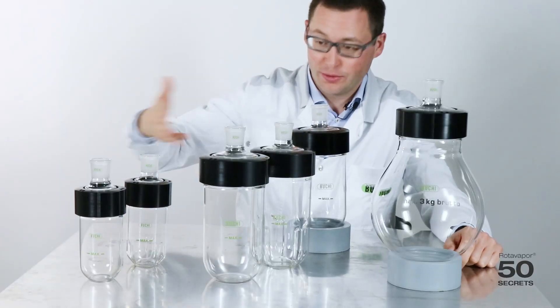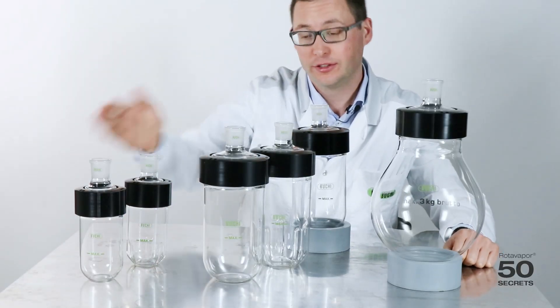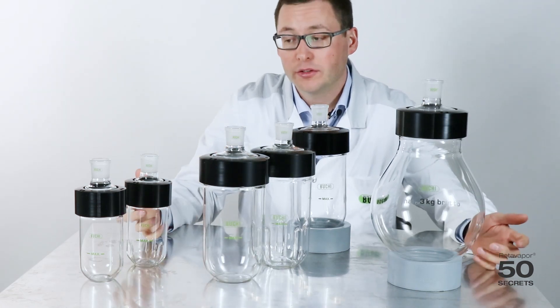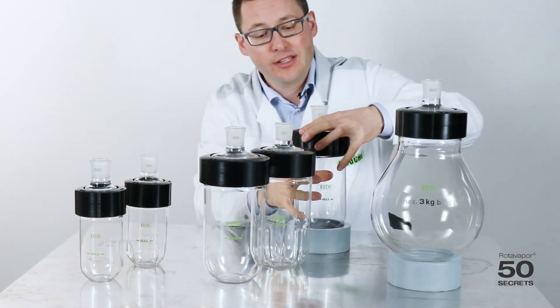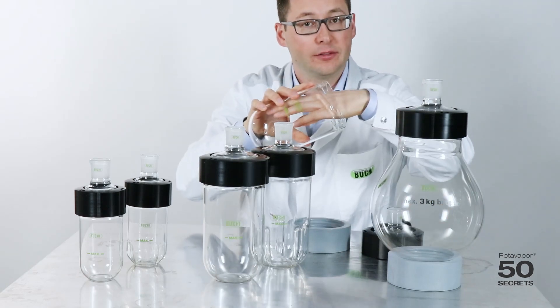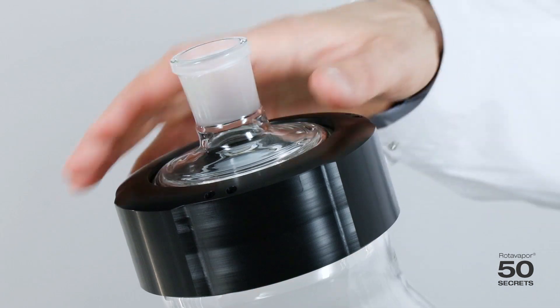Today's secret is about these beaker flasks. We have the 0.5 liter, 1.5 liter, and the 4 liter. The advantage of all of these beaker flasks is that you can very easily open them and reach in with your hand. I would like to show you how easy it is to open this beaker flask.